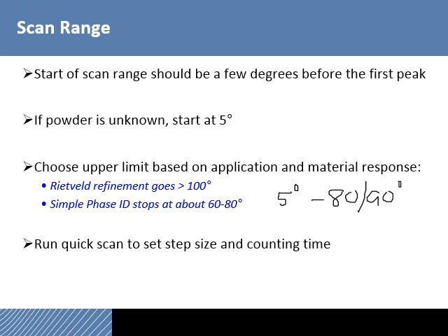And in fact, in the pharmaceuticals world, the accepted range for pharma, I'll just write it on here so you have it. Pharma operates in the 3 to 50 degree range.